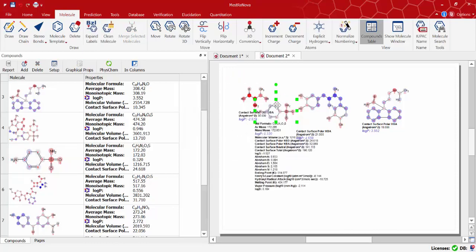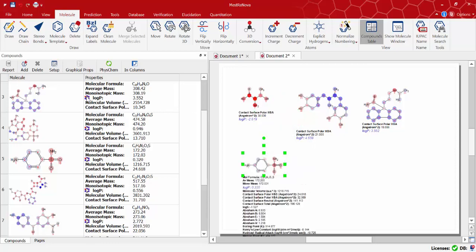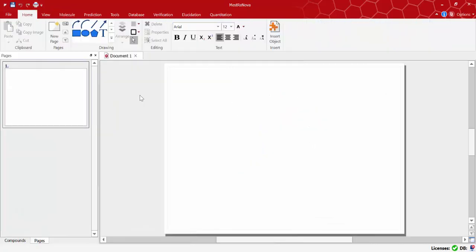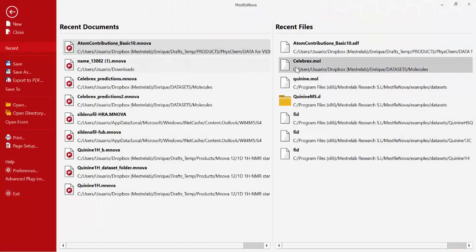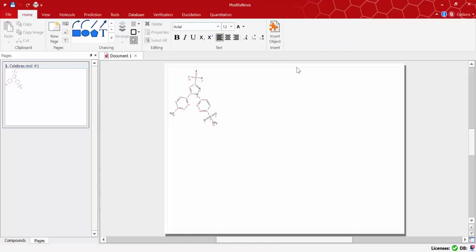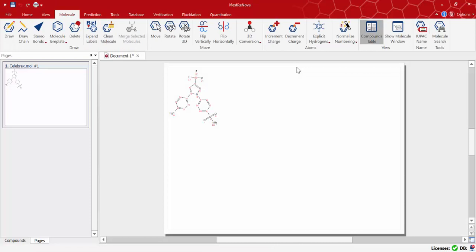Up to here we've only dealt with the basic properties package. MNOVA PhysChem also provides what we have called special properties for which you need a separate license.